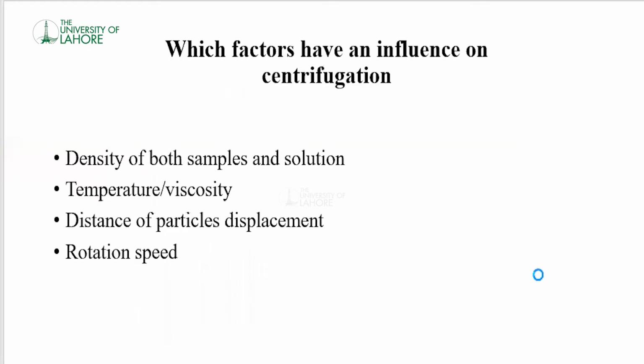Which factor has a greater influence on the centrifugation? Density of both sample and solution, temperature, distance of particle, rotation speed.